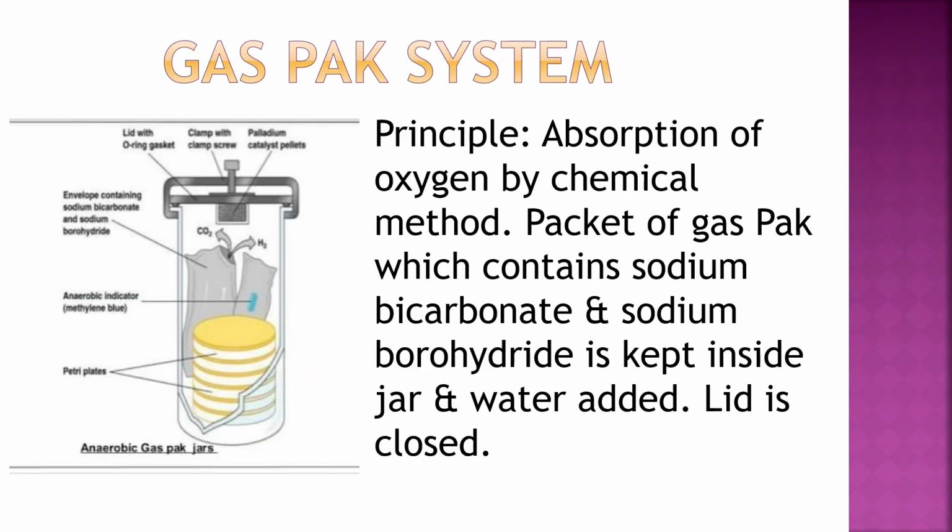The principle of this is absorption of oxygen by a chemical method. A packet of gas pack which contains sodium bicarbonate and sodium borohydride is kept inside the jar, water is added, and the lid is closed.